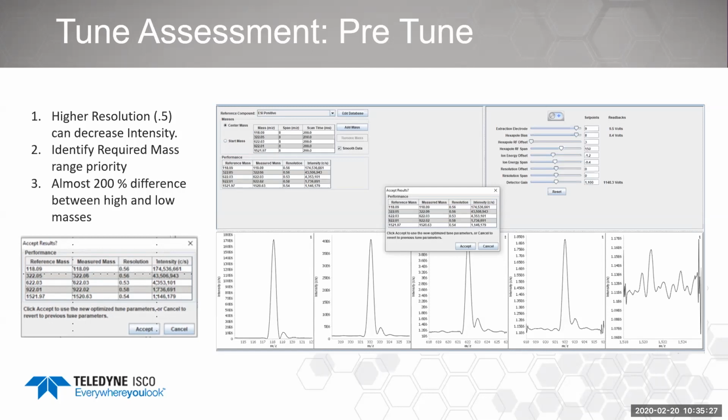Right now, we use a 0.5 mL/min flow rate for the interface, and that's to make sure that we have a quick enough response time so that we don't miss material as it's going through the instrument. The other instruments that we have out there that are doing flash, the ACCQPrep and the NextGen, they both are typically running about 0.7, 0.8, and that's all controlled through the software. It's hidden. It's not something we can actually change. We can take these questions, of course, offline if you have some more further detailed questions or issues with that.